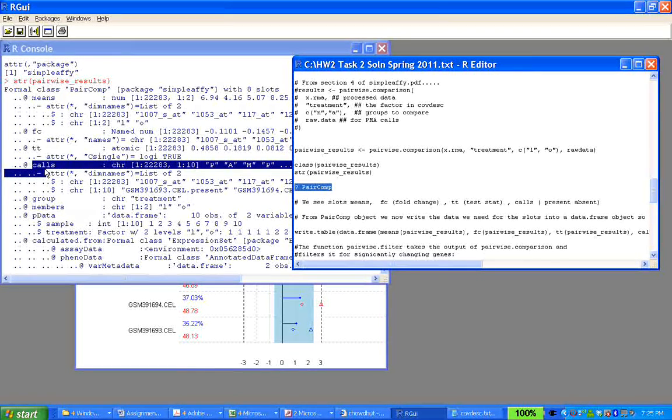So you can save it into an Excel file. You can easily extract an element or a column out of that frame by using the dollar sign or parentheses, etc. So it becomes much easier when you take data out of a somewhat complicated class and put it into one of the basic objects in R, like data.frame or matrix.